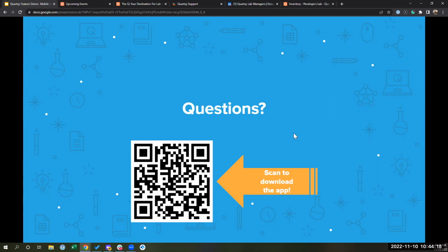If the barcodes are associated to their own self-generated numbers, the only thing that we will need to do is make sure that those numbers are associated to your inventory items. So you will just need to add a custom field to include that item in your inventory record. And again, you can do this in bulk. If you want to go back and look at our first session recording, you can do this in bulk by adding the custom field and then mass uploading these numbers in a spreadsheet.